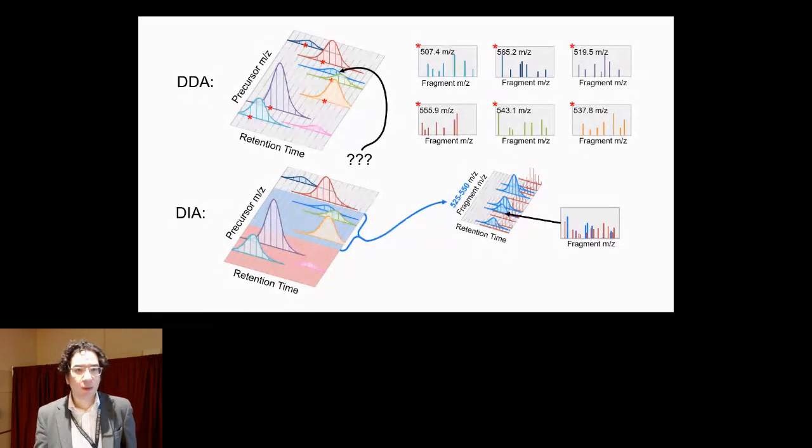In some ways this is a really powerful technique, because many lower abundance peptides would have been completely missed, since their intensities wouldn't have been high enough to be selected with data-dependent acquisition. But with DIA, the problem is now on the computational shoulders, where we have to extract the signal of this low abundant peptide from a sea of otherwise noise to be able to interpret that detection.